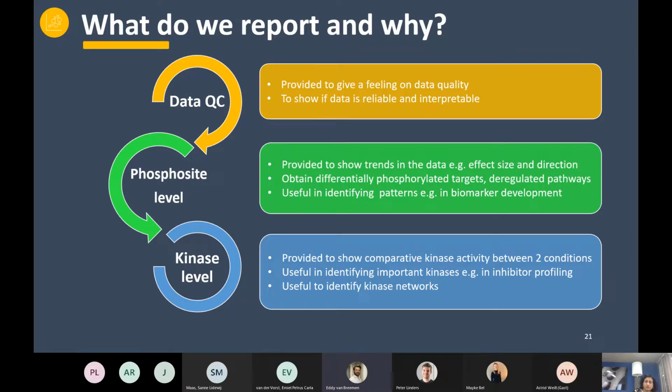It was an interesting question from Emil, related to the question we discussed before on the mouse kinome. Do we have a list of kinases that are included in the analysis that are present in human samples, but for example not in mouse or rats? With such a list, they could then afterwards exclude these kinases.